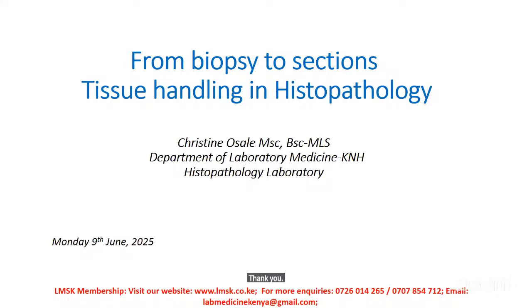Thank you, Fred. Hi, everyone. I hope you can hear me. My name is Christine Osale from Kenyatta National Hospital, Laboratory Medicine, Histopathology Laboratory. As Fred has said, I have a Master of Science in Clinical Histopathology and Cytology, in addition to a BSc in Medical Laboratory Sciences. Today, our topic is from biopsy to sections, that is, tissue handling in histopathology. Welcome, everyone, to the webinar.